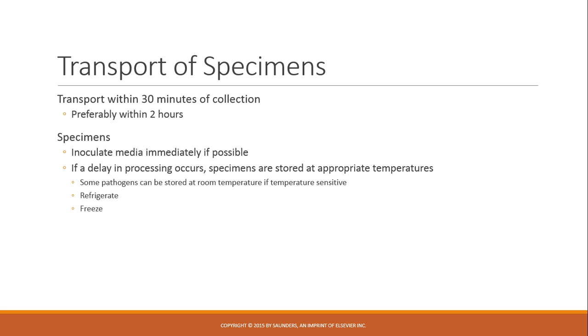Transport within 30 minutes or within 2 hours, and this may change depending on where it's coming from, and the laboratory can take into account those kinds of situations. For example, if it's from a physician's office, they'll instruct the nurses to place it into the refrigerator until it's collected, or place it on ice or in a freezer, or collect it in these particular containers that contain a preservative, whatever the sample or whatever the case may be.